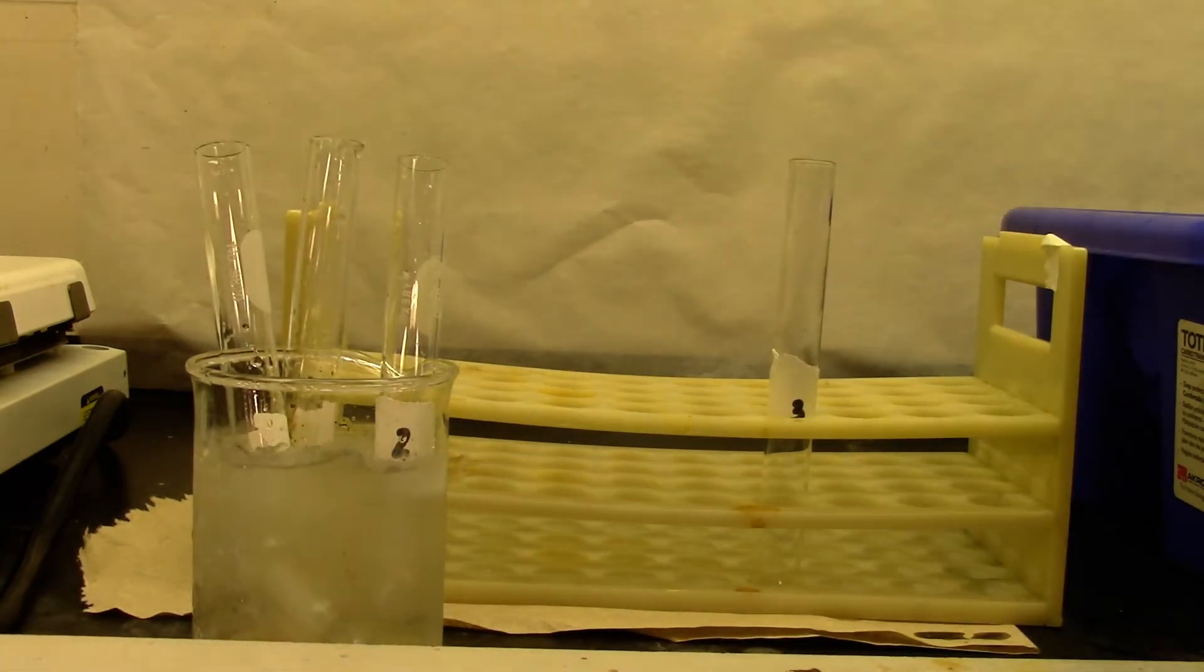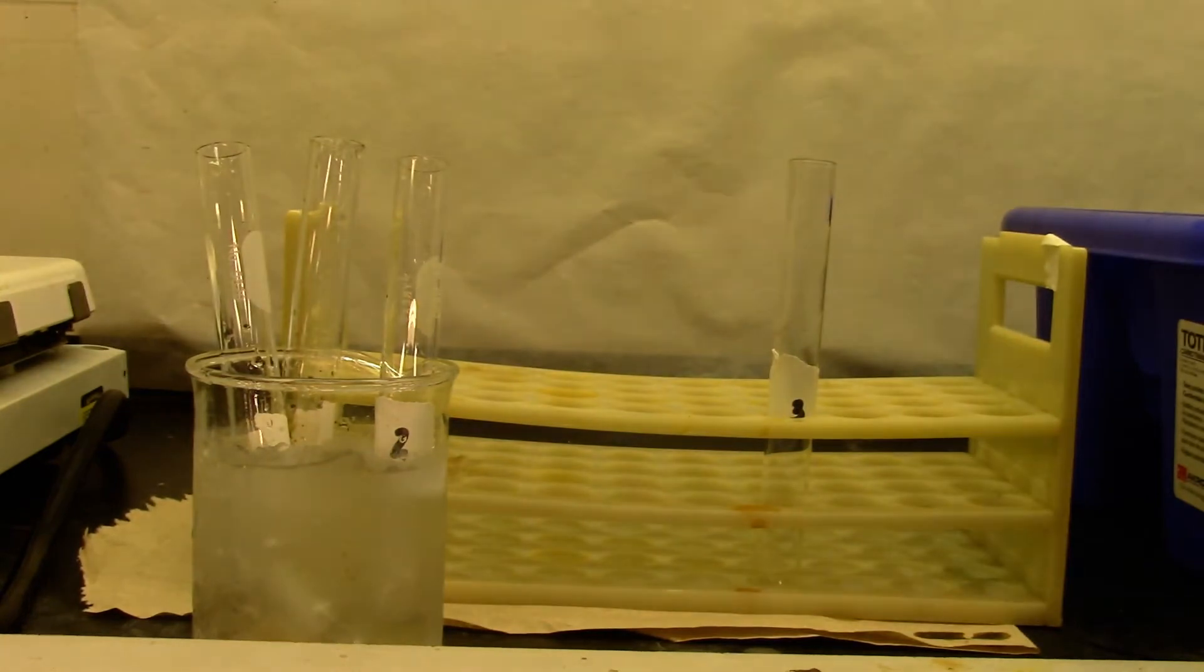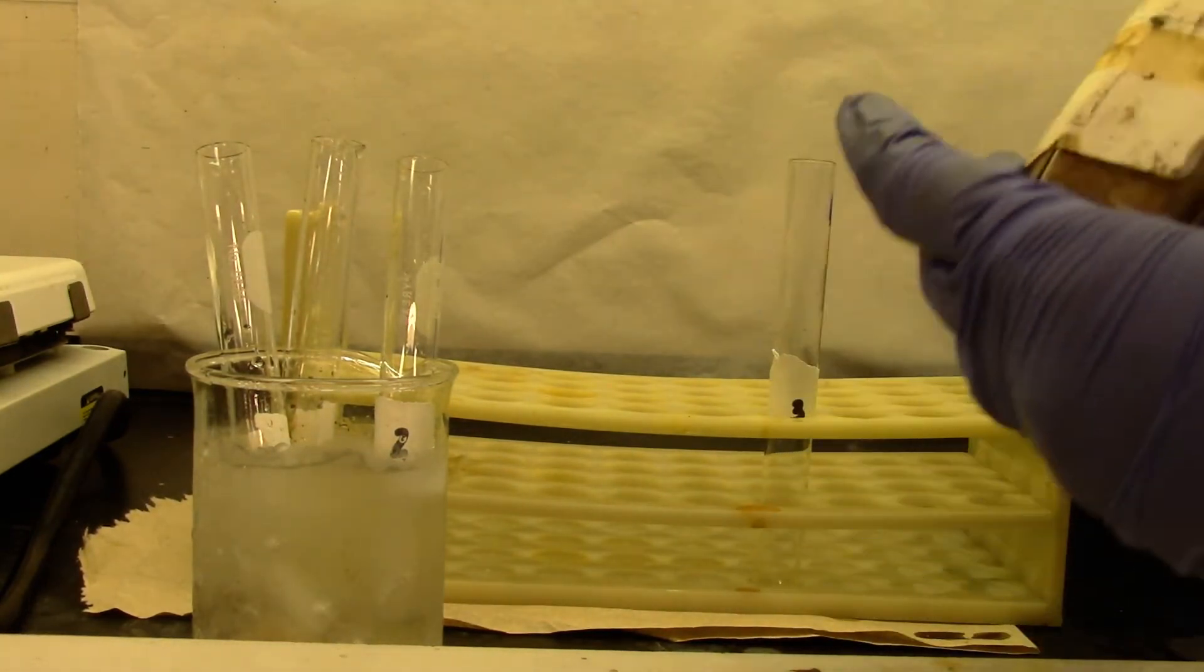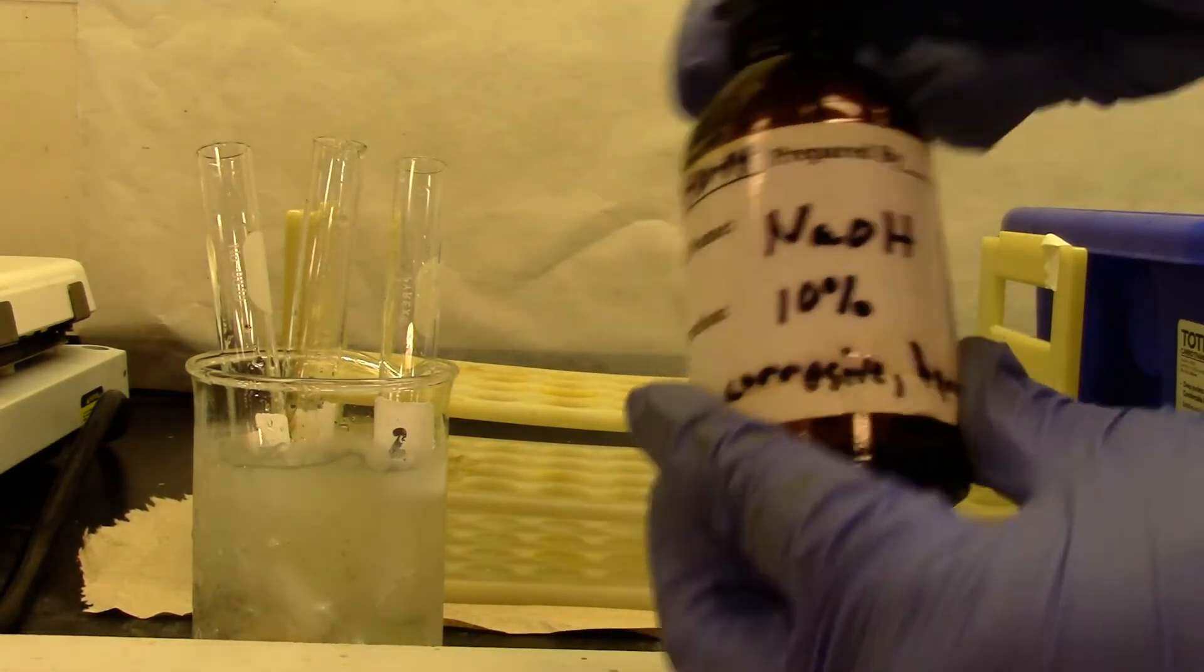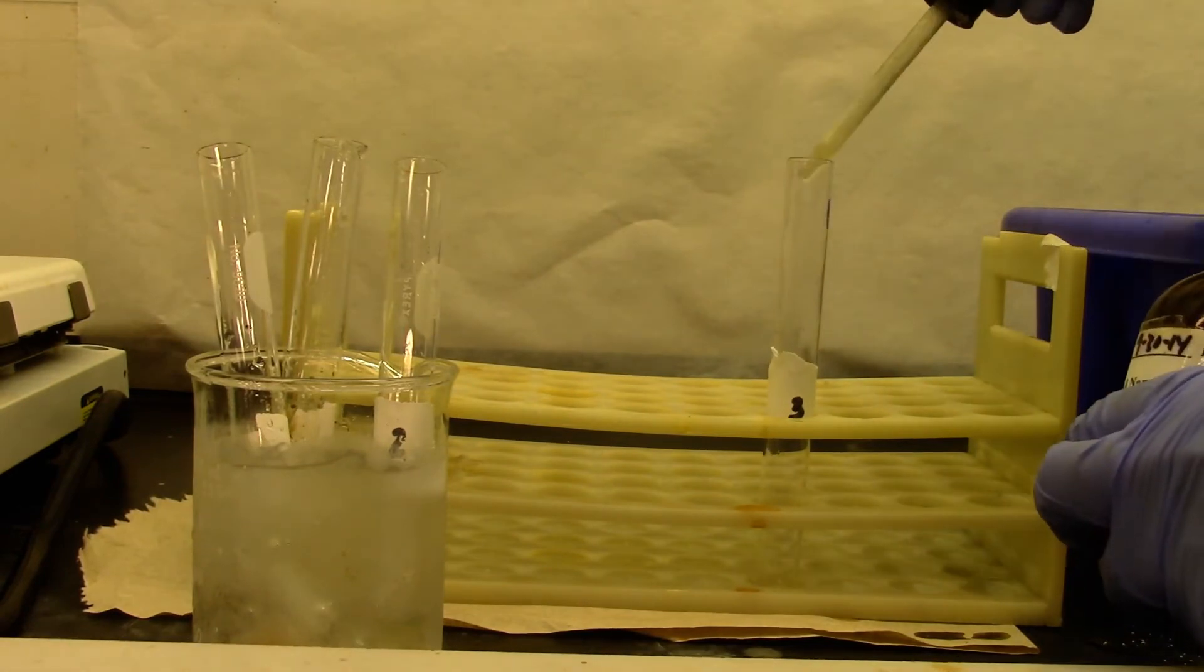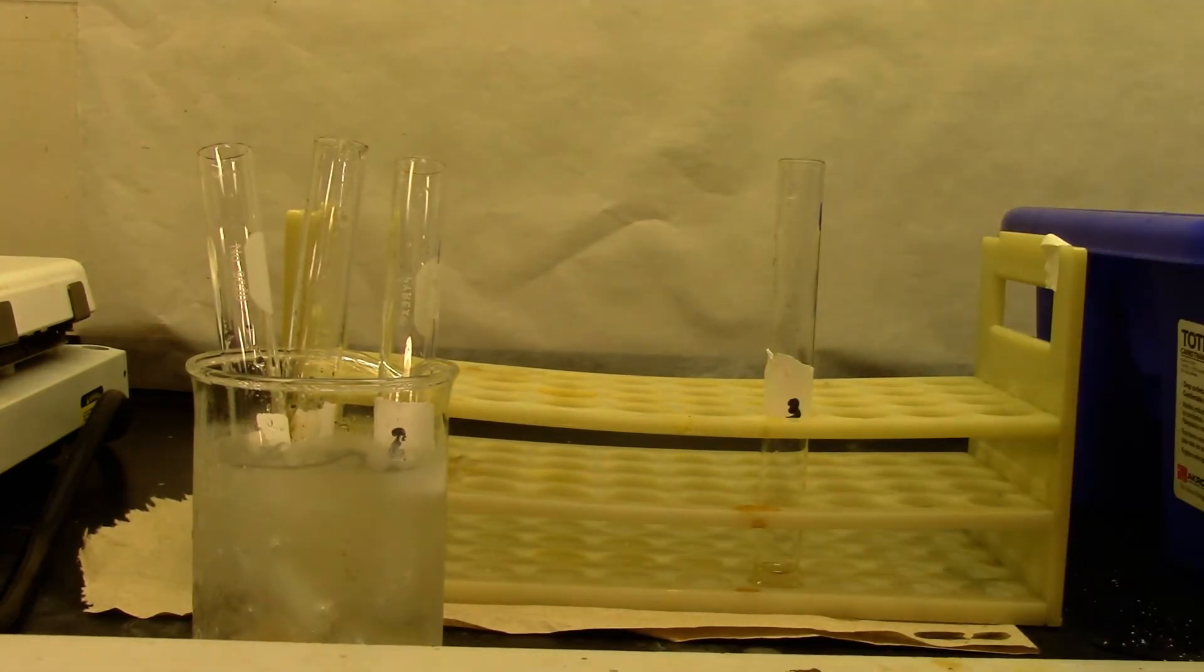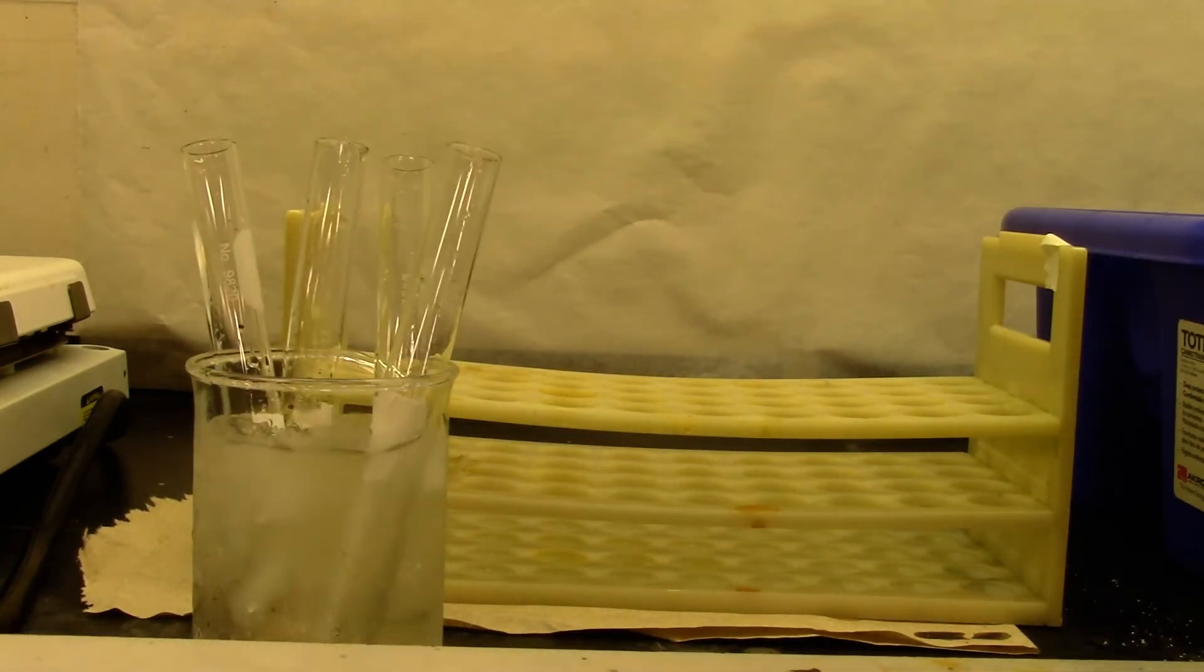This is also going to cool in the ice bath. For the third test tube, I am going to prepare a solution of beta-naphthol. A pinch of beta-naphthol, and about 1 mL of 10% sodium hydroxide to prepare a solution. Give it a mix. We will place it in the ice bath as well. Everything needs to cool down.